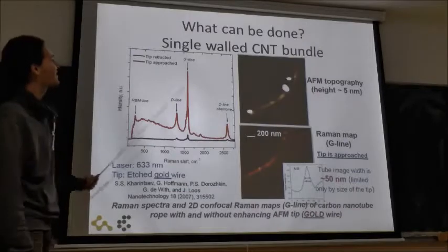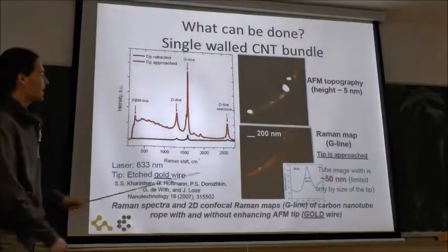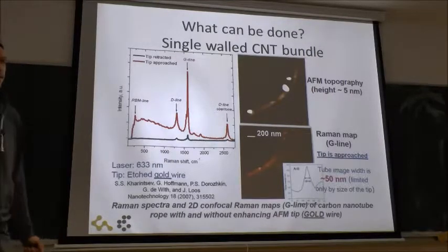So here is an example of TERS, how we can improve the Raman spectra if we use tip-enhanced Raman spectroscopy.